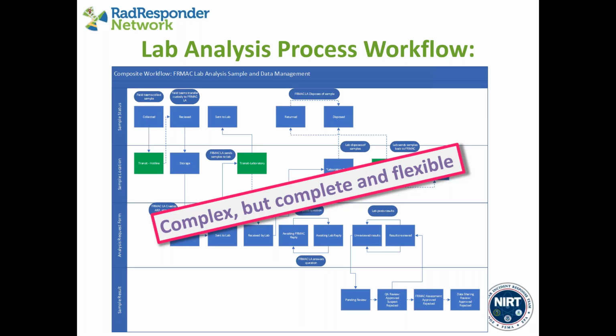Another nice thing about the way we've designed this is that it's fairly flexible. If you don't want to do a certain step, you don't necessarily need to, as long as you're okay with not having the detailed metrics that others might need. You can kind of fit it to the way you want to do business, but it will still pretty much align with what the FIRMAC is doing.